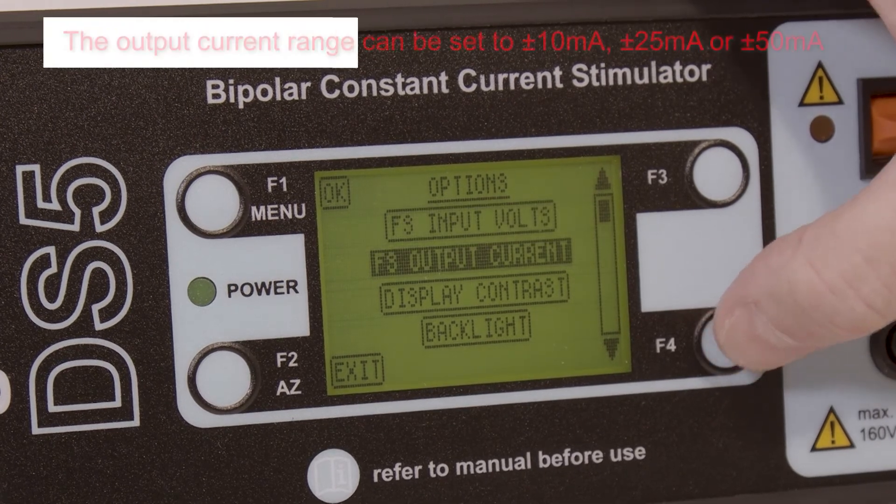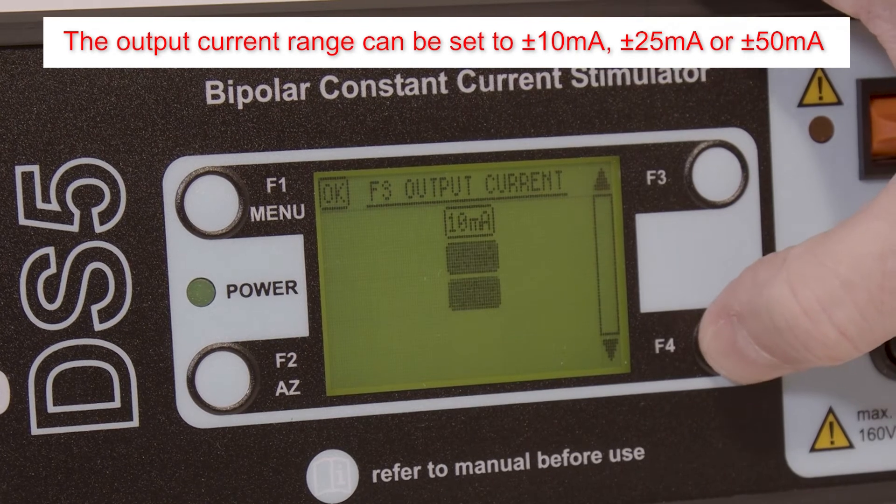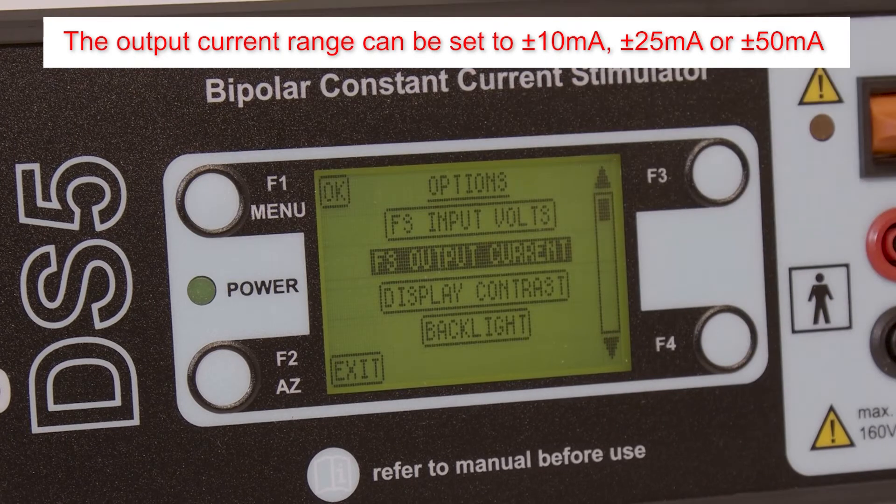There are three options for the output current range: 10mA, 25mA, or 50mA. This should be set at a value suitable for the chosen stimulation protocol.